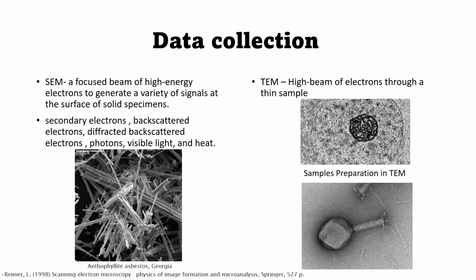Now, these can give us more detailed images. As you can see, we have the photo of the cell. We have the cell nucleus here. We can see the thin line of the membrane on the outside. And this could also be used, for example, for looking at different transitional phases, such as metaphase, anaphase, telophase, all of those. And then, like I was mentioning about diseases, we have an example of a virus.